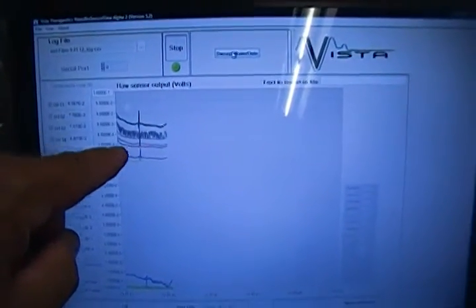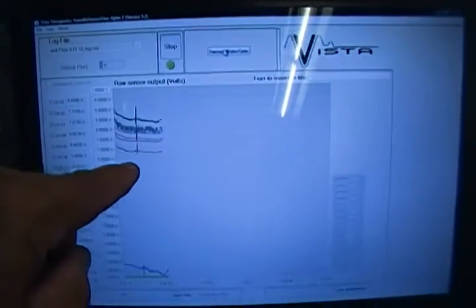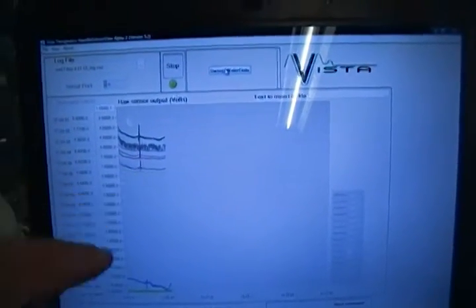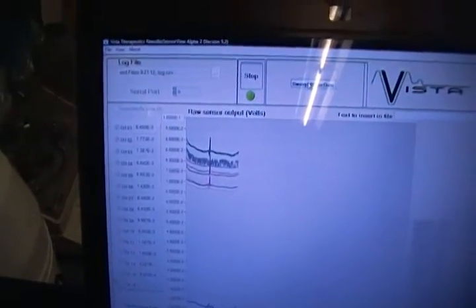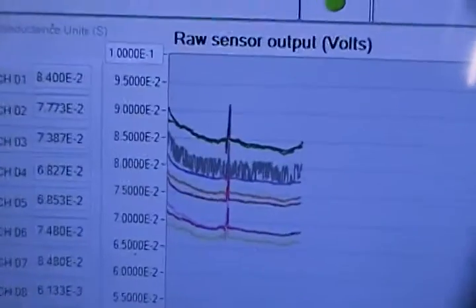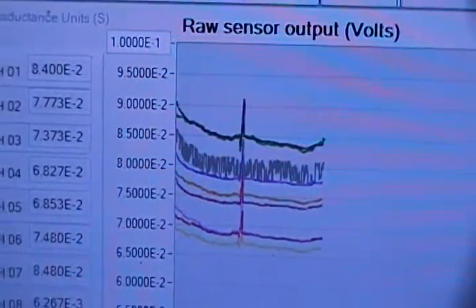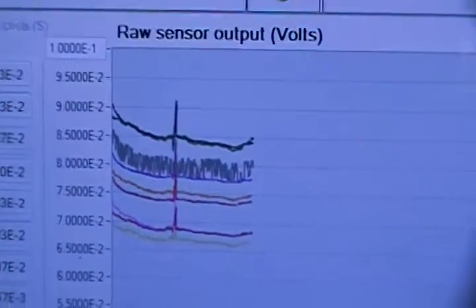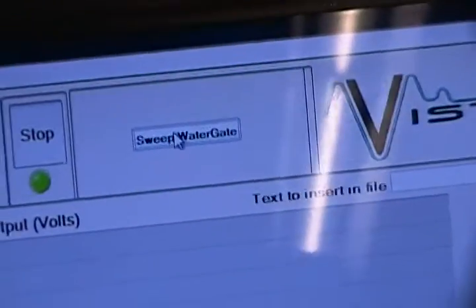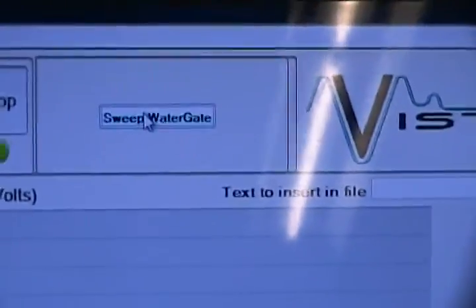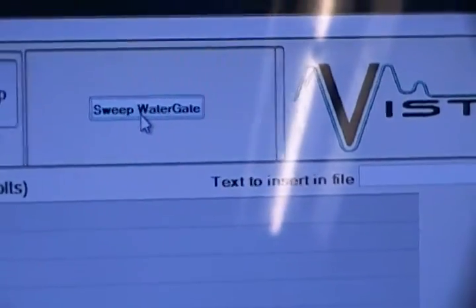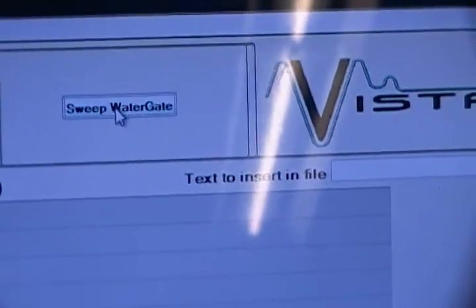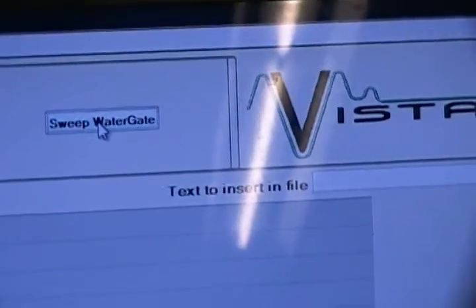The second thing that we can do, and you can see that we have very good transconductance through several nanowires. And just so you can see the numbers here, we're looking in the millivolt range, seven times ten to the minus two volts. One way to normalize is we can actually then do what's called a voltage sweep. That means we run a known voltage through each of the nanowires, and we determine how they respond. So I'm going to do that now.